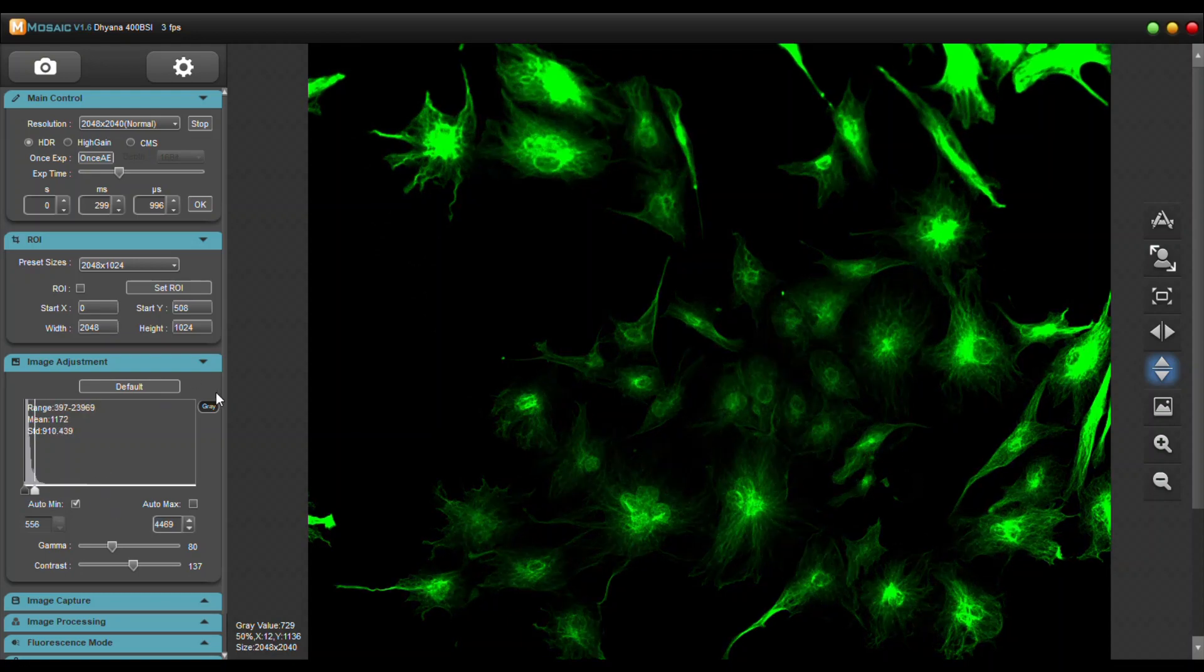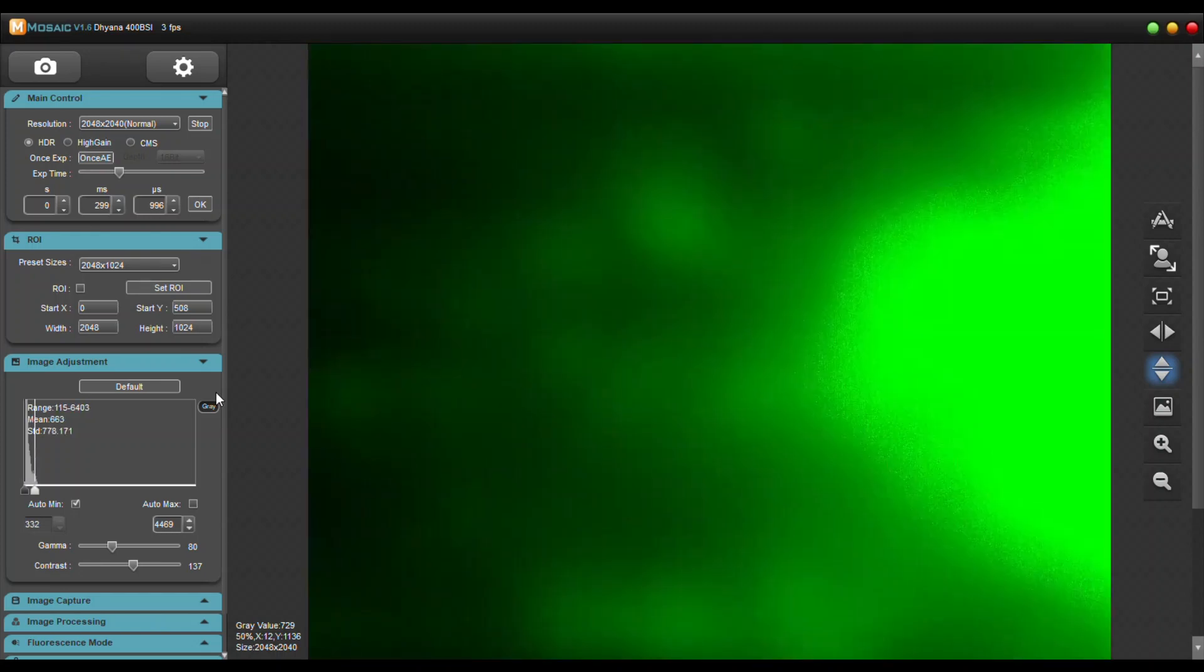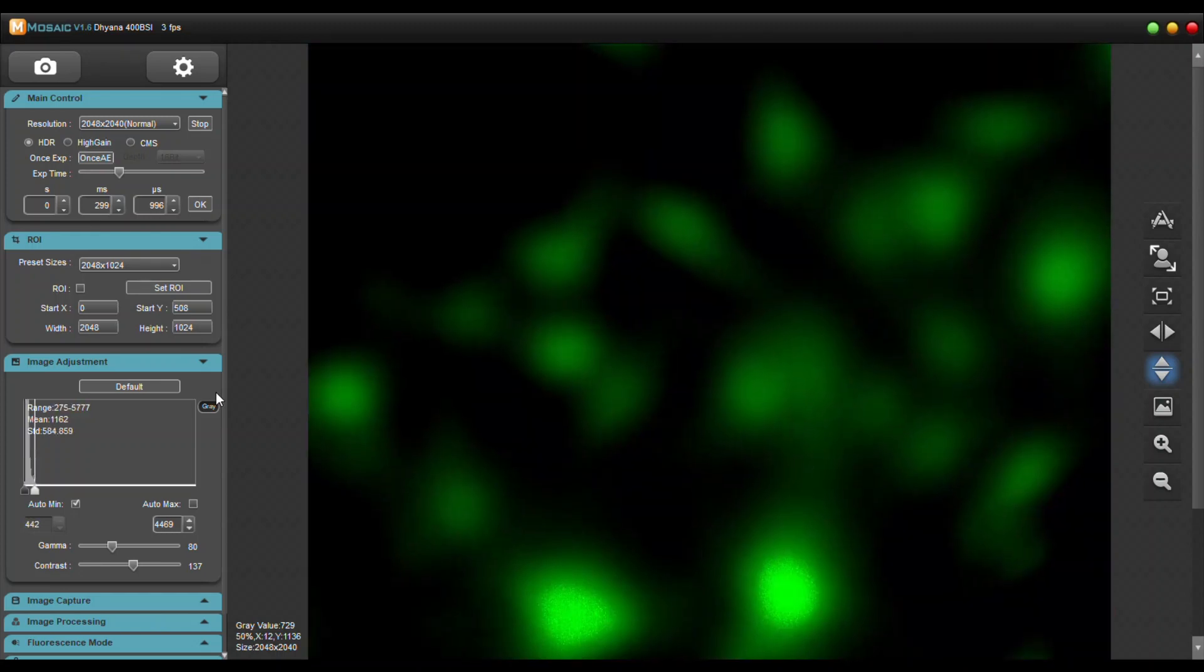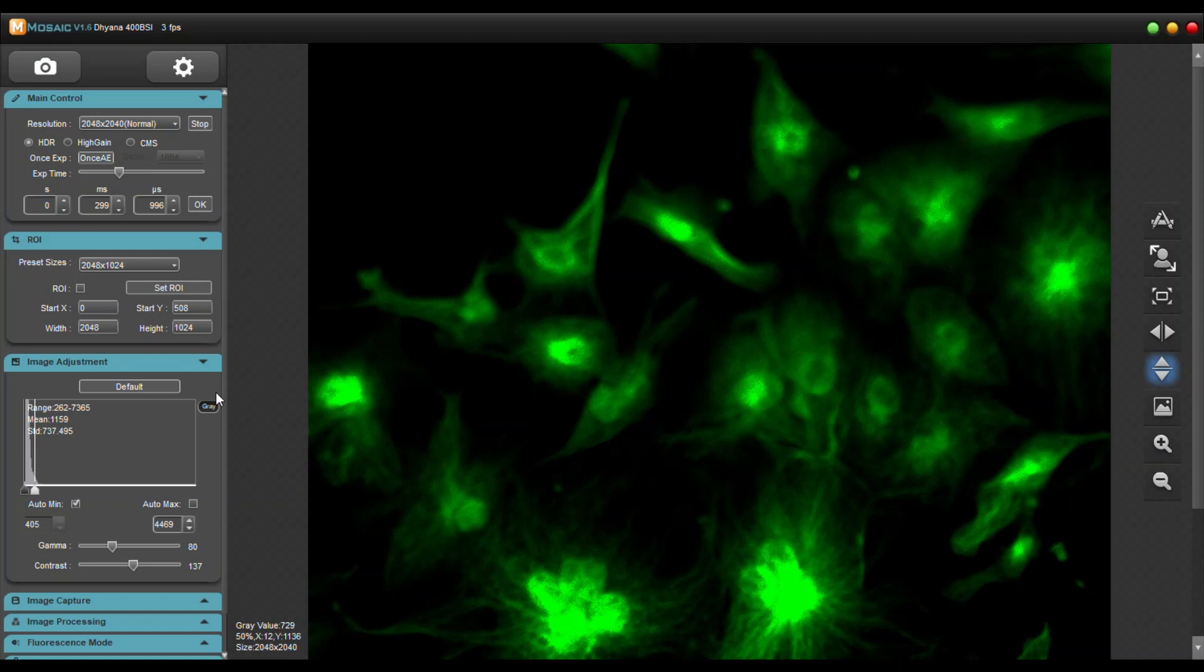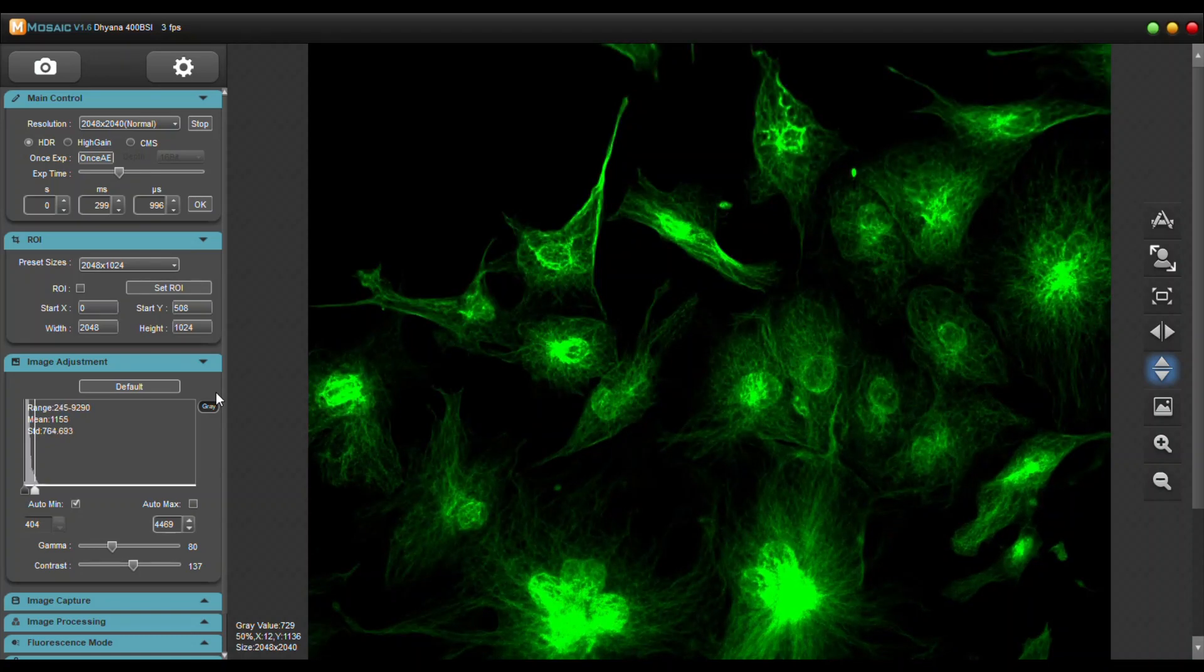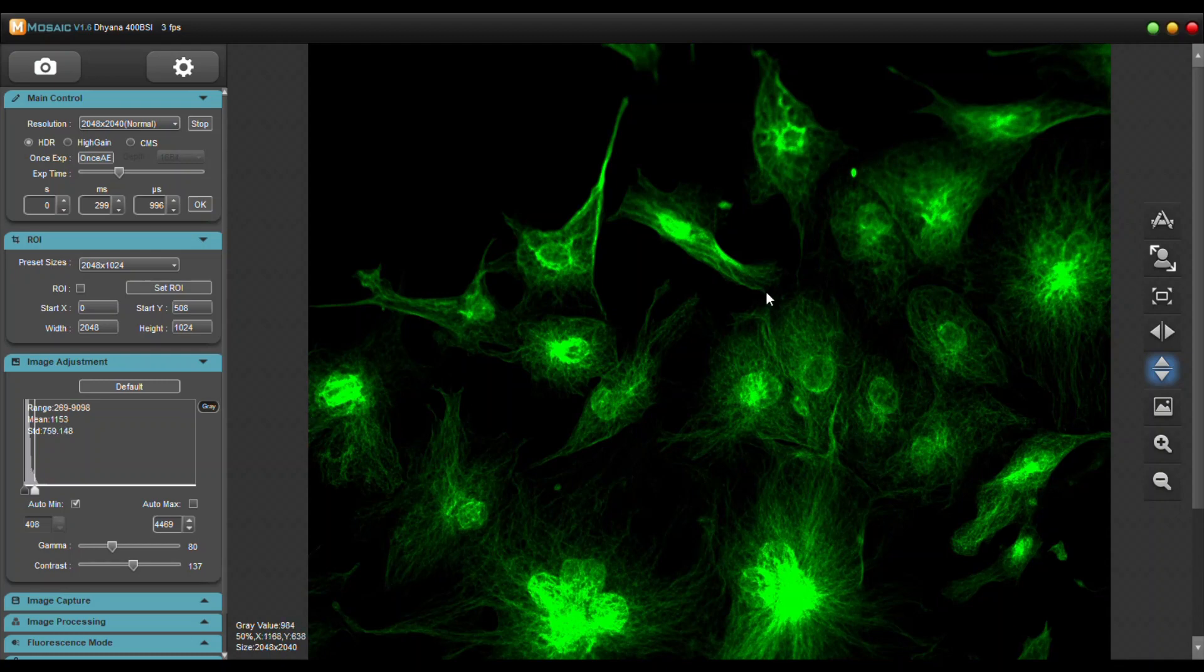So let's jump into a 40x objective and see how clear it is up close. Now that's a pretty great image if I do say so myself.